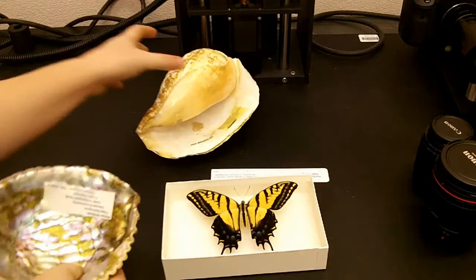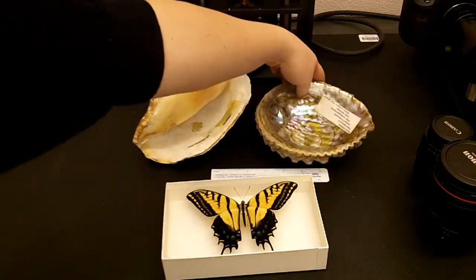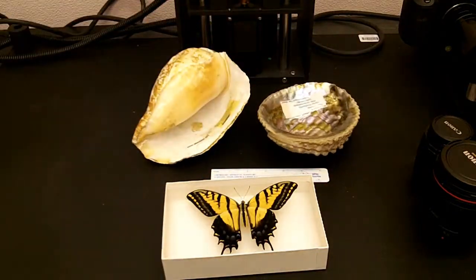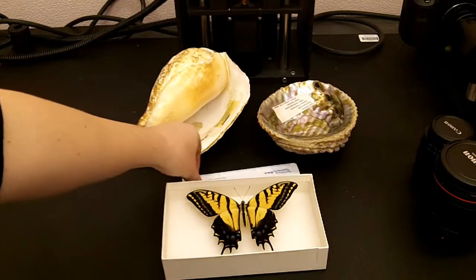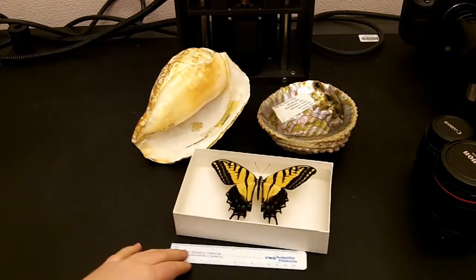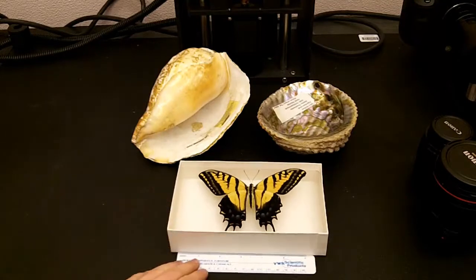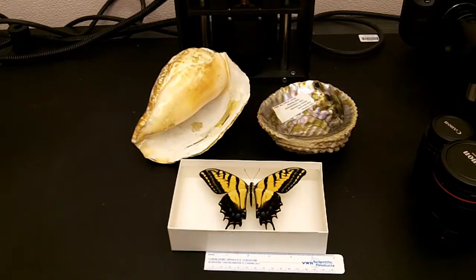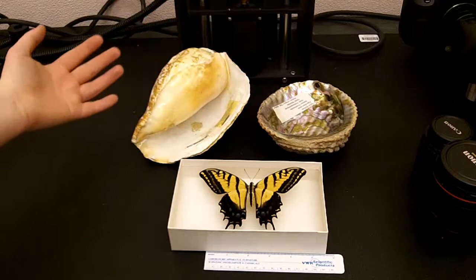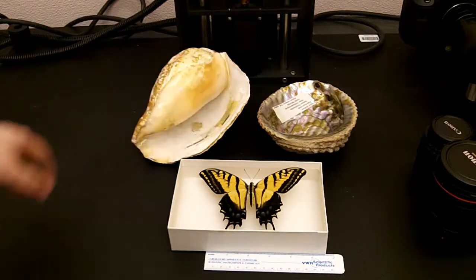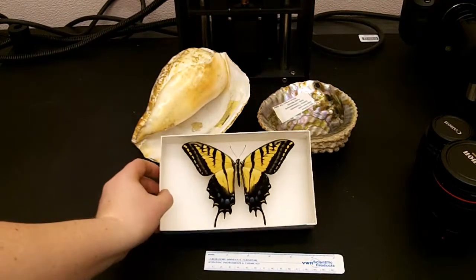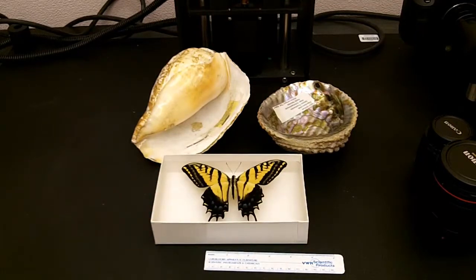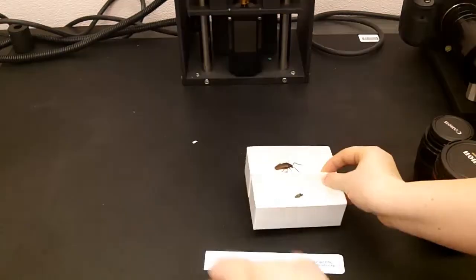So, for anything smaller than that, it's best to use the 50mm. And here is a 15cm scale marker to give some sort of reference. And so, here we have two large shells that are larger than my hand, as well as a large butterfly. And these would be perfect to be imaged using the 50mm.